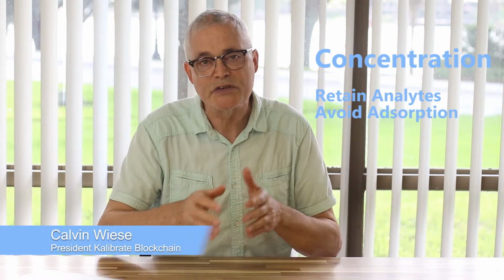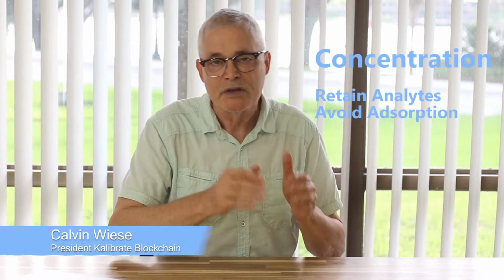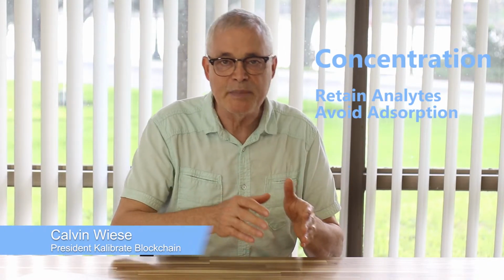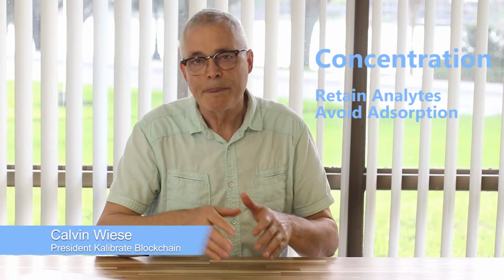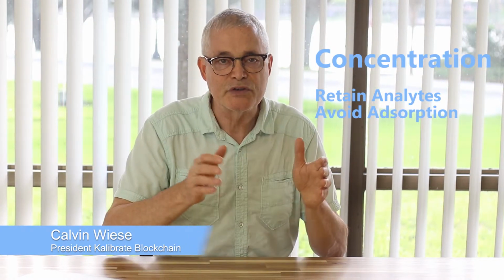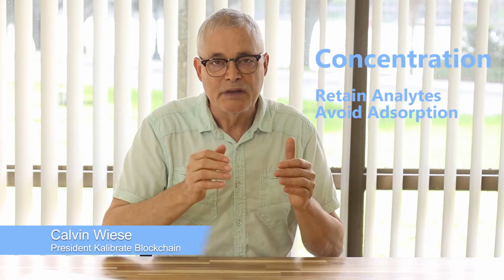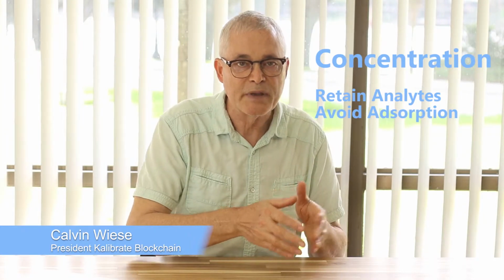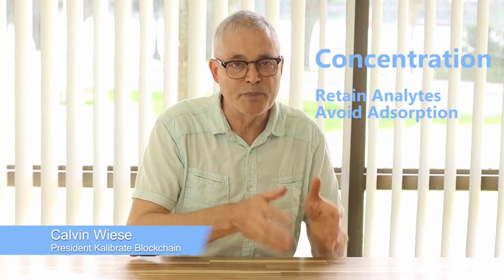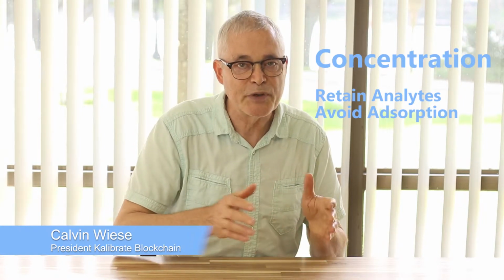Further, it must be done in conditions that avoid the risk of analytes adsorbing to solid surfaces. Solid surfaces are the enemy of very small scale. As scale gets smaller, the ratio of solid surface to volume increases at an exponential rate. This dramatically limits the solution space for this problem. And as this scale gets smaller, fabricating difficulty gets exponentially greater.